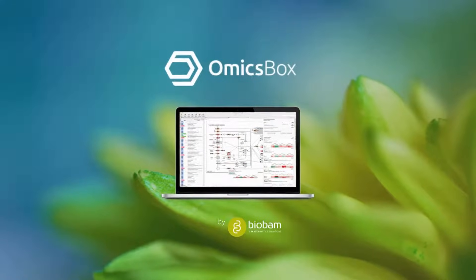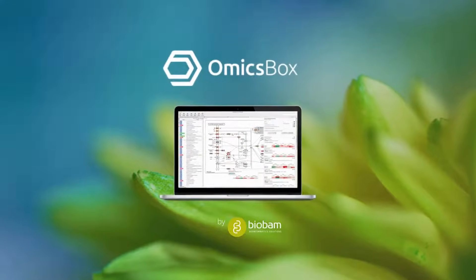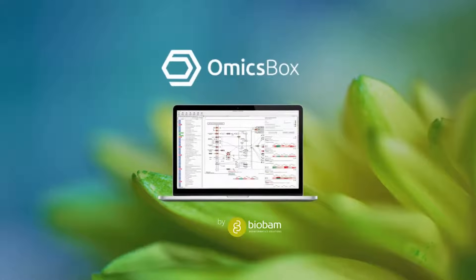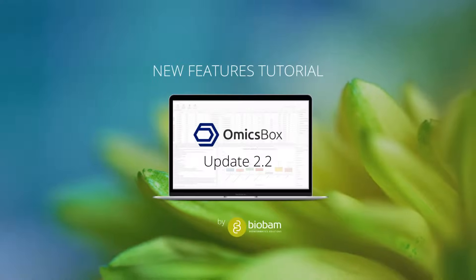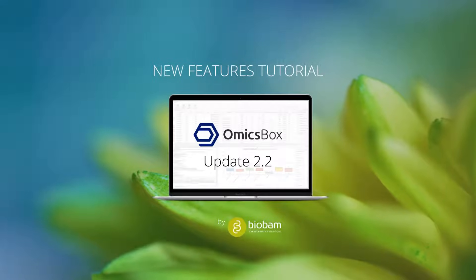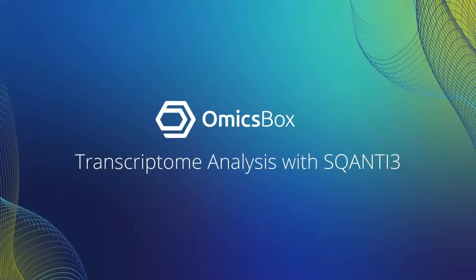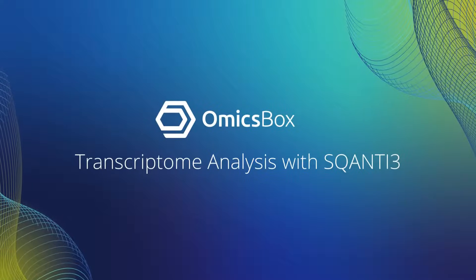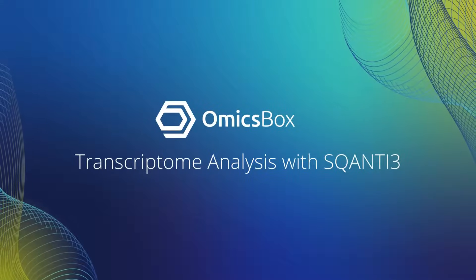Welcome to OmicsBox, bioinformatics made easy. New Features Tutorial: OmicsBox Update 2.2 Transcriptome Analysis with SQANTI3.